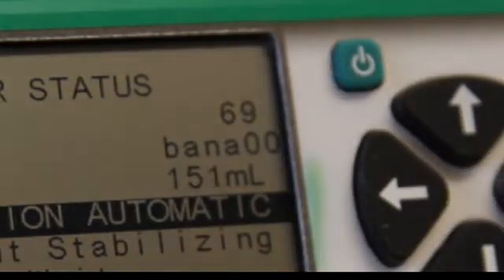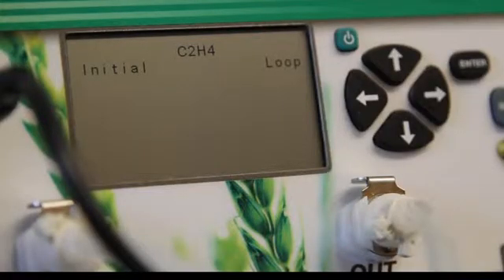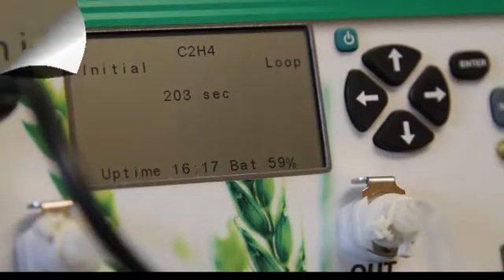Eventually, it will reach 100 consistent data points. This is when it enters the initial loop phase. This is a 3 minute self-calibration, setting the background zero phase. The timer on the screen will tick down until self-alignment has finished.